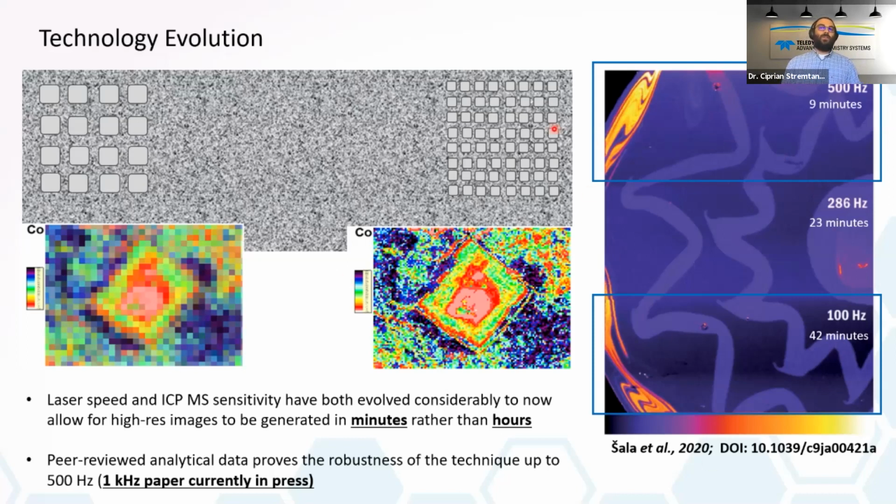So we selected Murano glass beads, so one of those tiny and highly decorative glass objects manufactured in Venice, in Italy. And we split that particular sample into 3 equally sized areas. And each of those areas was then ablated and analyzed using a different repetition rate.